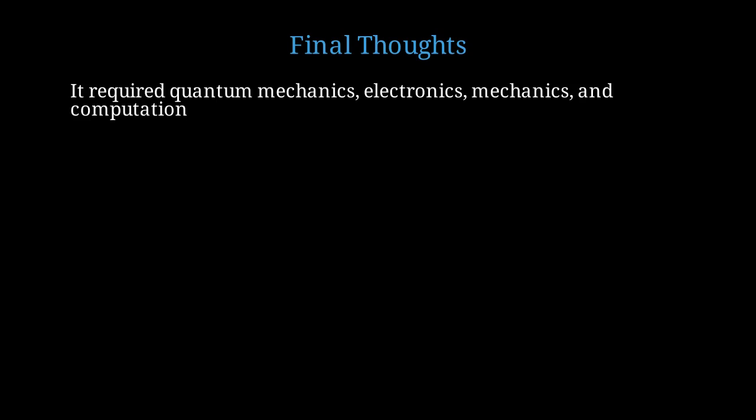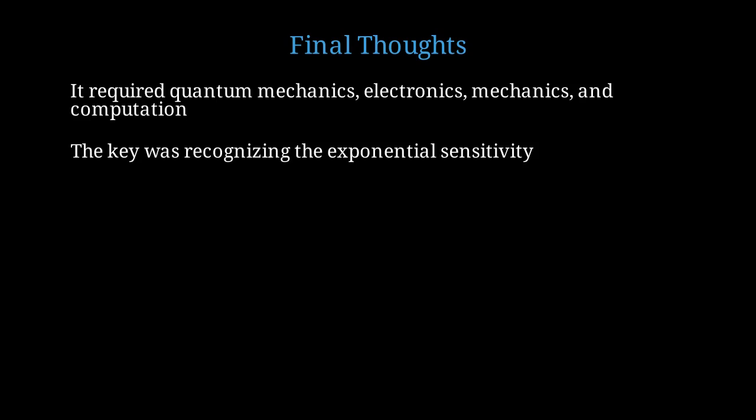The scanning tunneling microscope is a beautiful example of how a fundamental quantum mechanical principle can be transformed into a practical measurement technique through careful engineering and deep physical understanding. Building a working STM requires knowledge from multiple domains: quantum mechanics to understand tunneling, electronics for sensitive current measurement, precision mechanics for vibration isolation, and computation for feedback control and data processing. The key insight was recognizing that the exponential distance dependence of tunneling current, which might seem like a nuisance, is actually a gift. It provides the sensitivity needed for atomic resolution.